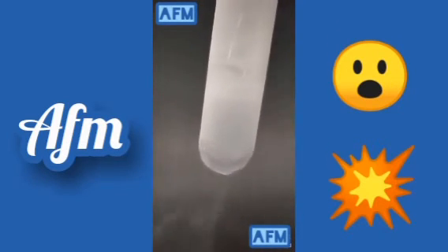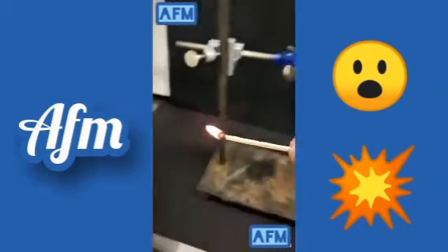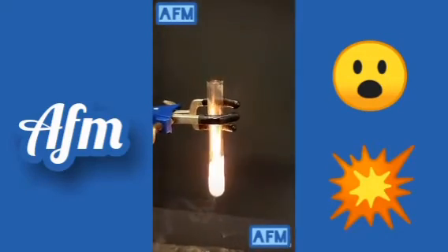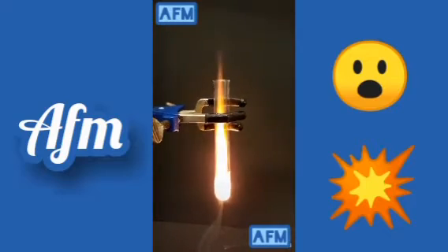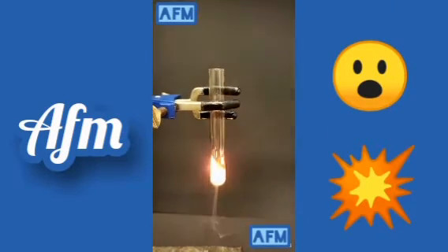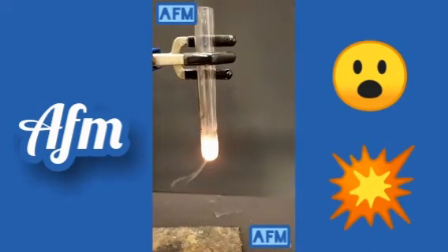Liquid oxygen is faintly blue, but it's really hard to see here, so I'm gonna put it in a smaller tube. It's still a bit hard to see, but it is definitely blue. Now this is very dangerous, but what's fun to do is to throw a match into it. As a liquid, oxygen is an even more powerful oxidizer, and it can sometimes react explosively. After this, all that's left is just a small part of the match head.